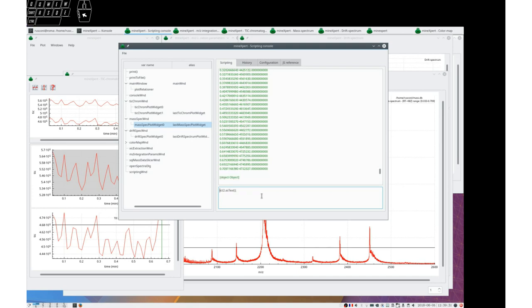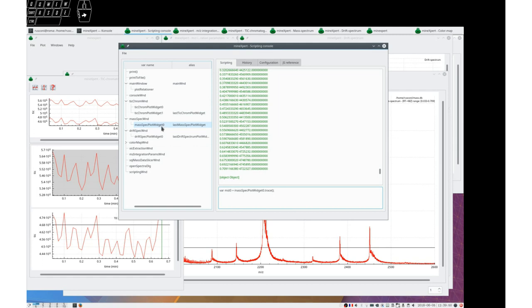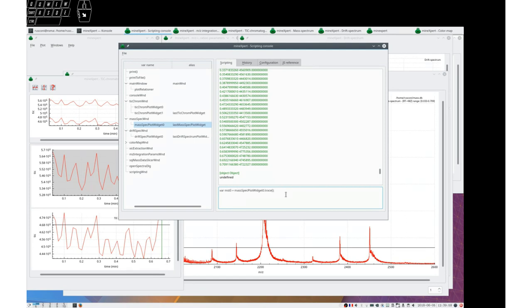but we didn't capture its identity. Var MS trace zero because that is the unique mass spec plot widget trace. And now let's say MST zero as text.